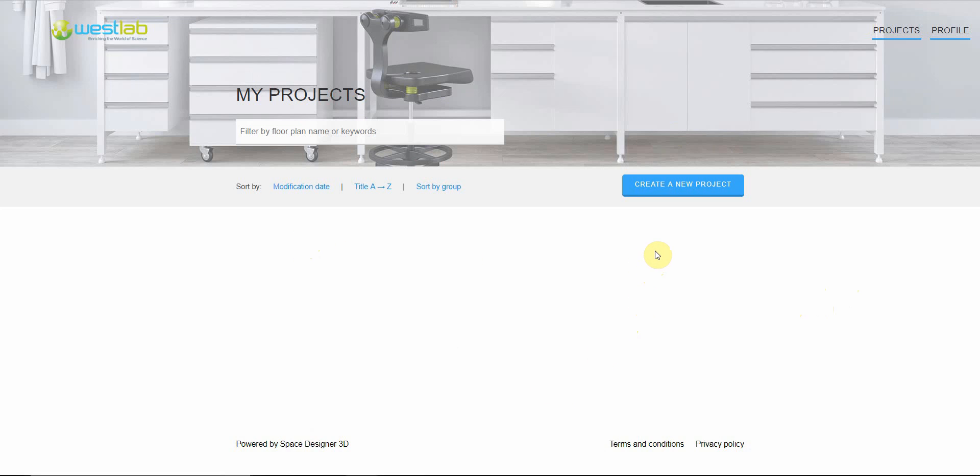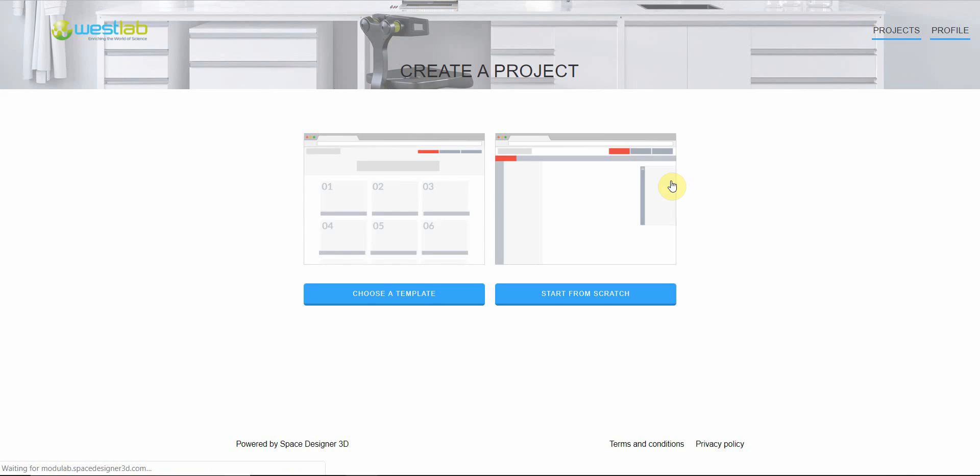To get started I'm going to take you through the basic functions to draw up your laboratory and we're going to start by clicking create a new project. This will take us to two options. We're going to select start from scratch.